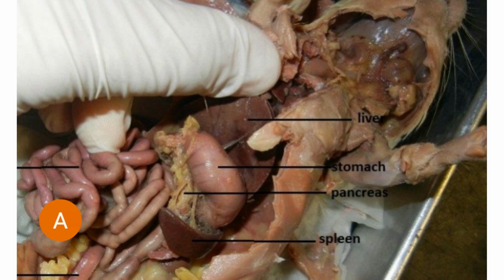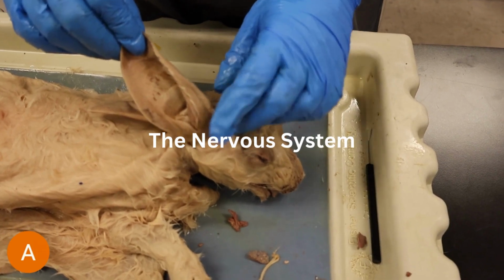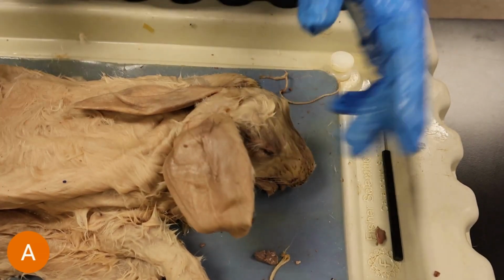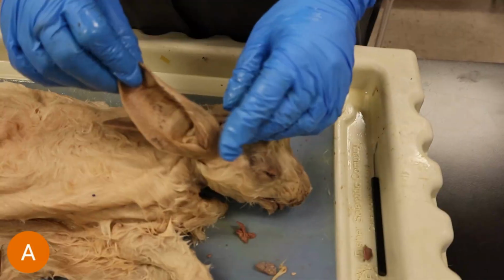Okay, so now we're on to the nervous system. So the nervous system does consist of the brain and the sensory organs. So here we're showing you the sensory organs. These consist of the ears that allow for hearing, the eyes that allow for seeing, as well as the nose that allows for smell. These allow the animal to find food more efficiently as well as avoid predation better.